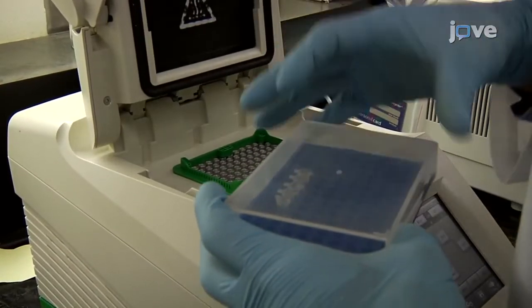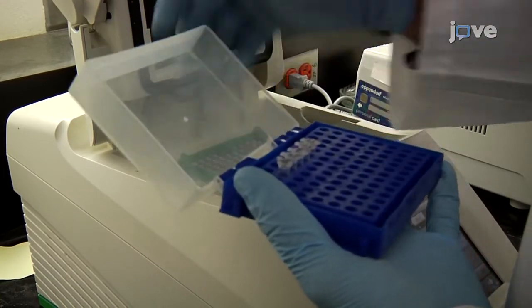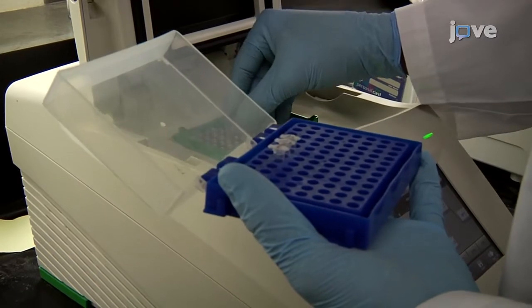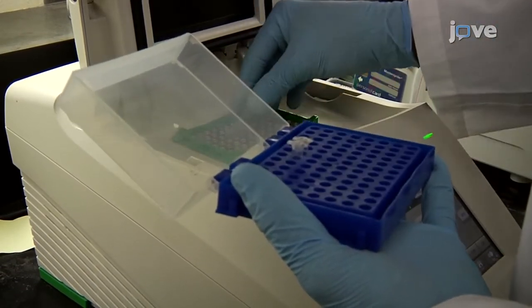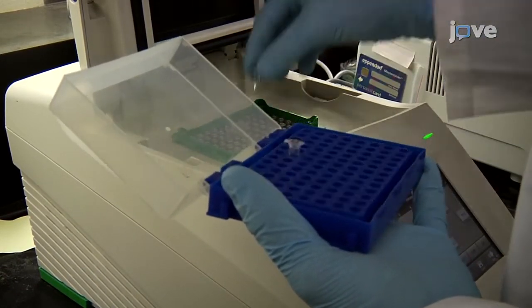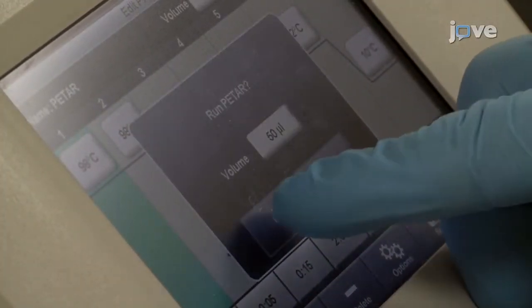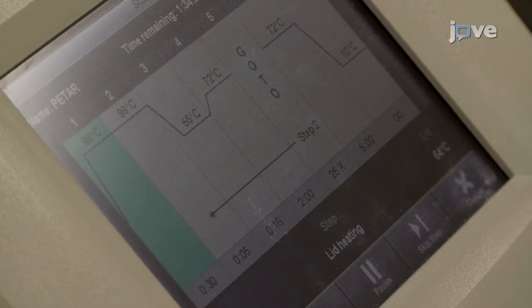Amplify simultaneously, in separate tubes, the DNA fragments of similar size according to the recommendations for the DNA polymerase used. Perform 25 to 28 PCR cycles, or determine the number of cycles that produce sufficient DNA yield.